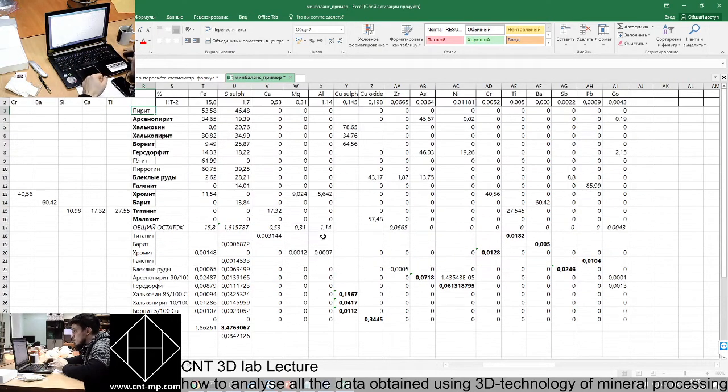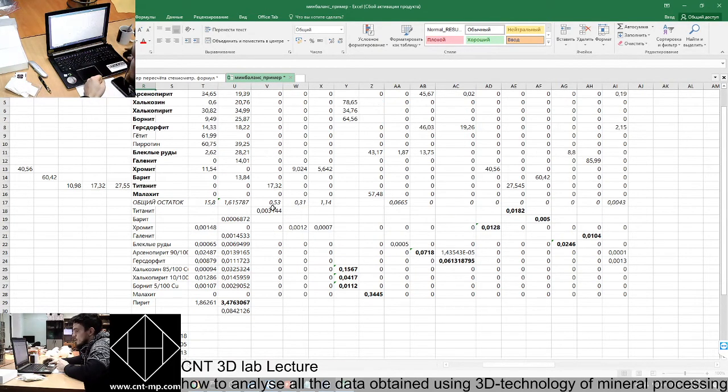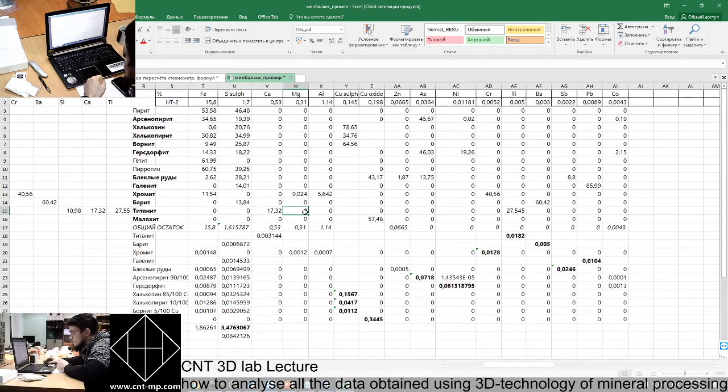So if the task was to analyze how much pyroxene is in this sample, we would definitely just perform XRD, but if the amount of pyroxene were small, for example in accessory cases, we would like to count pyroxene too.